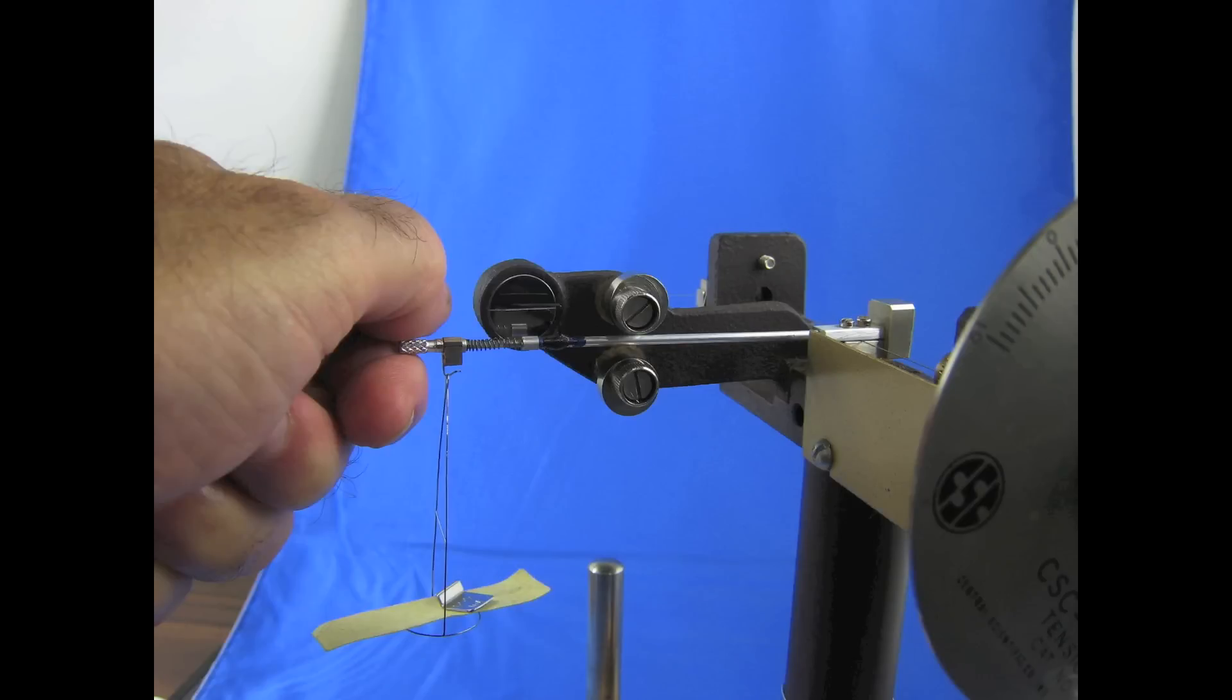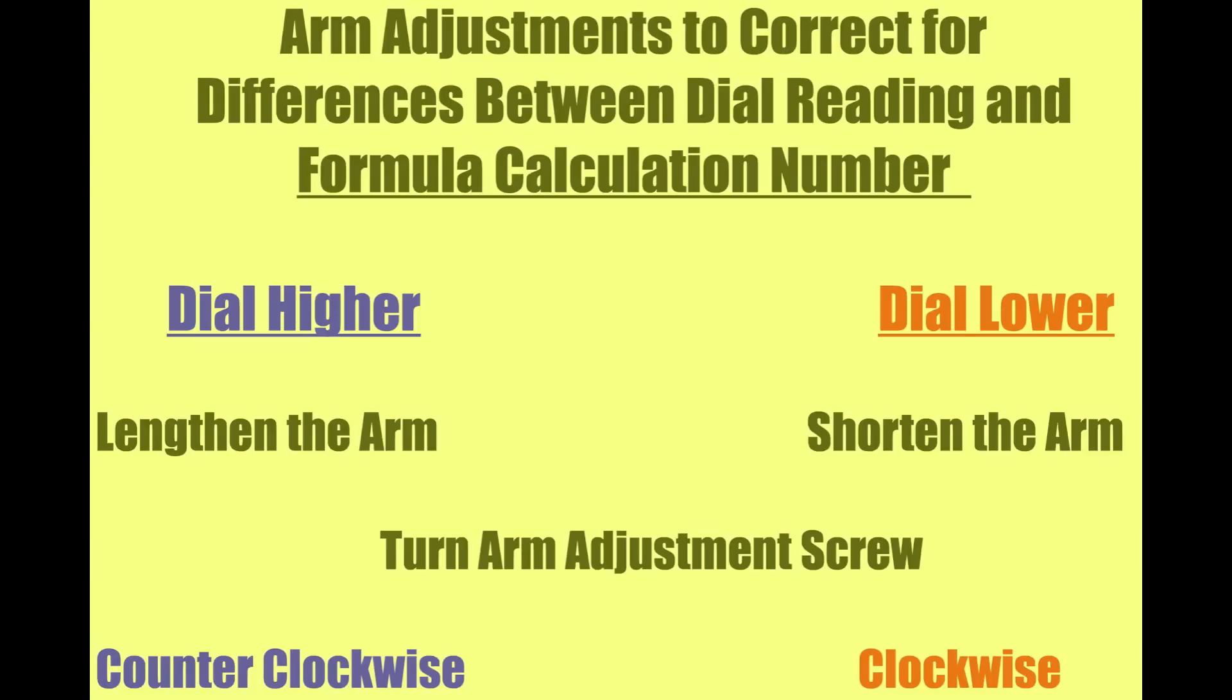If the calculated number is greater than the dial reading, use the torsion arm adjustment nut and turn it counterclockwise. If the calculated number is lower than the dial reading, turn the adjustment nut clockwise. One full rotation is about three dynes per centimeter. Repeat this until you can bring the pointer to the line.